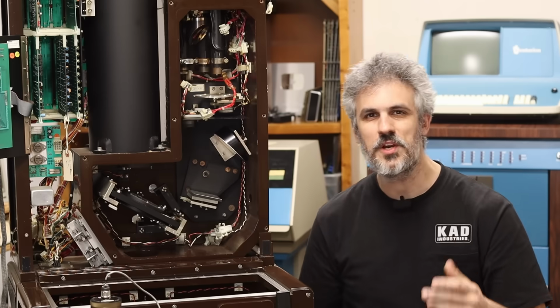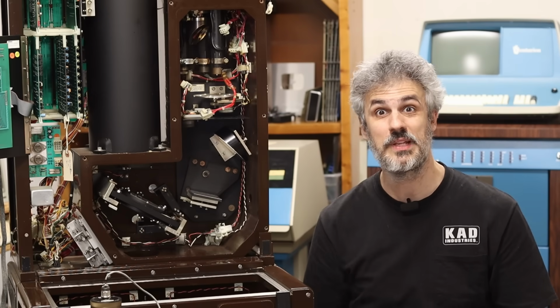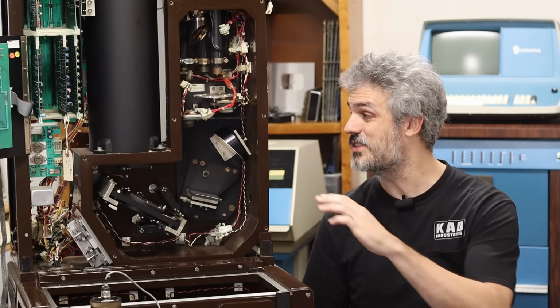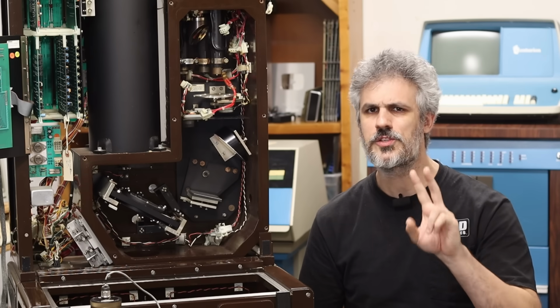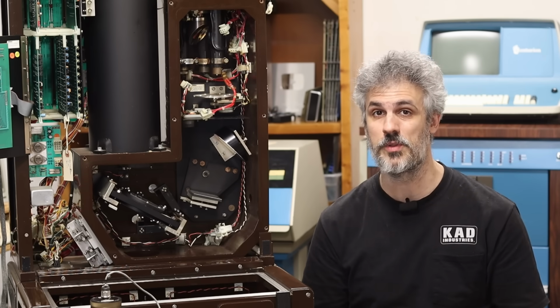So we have a beam splitter, we have a mirror and a tube that can move up and down, and we have a laser that will happily melt your eyeballs. Like, what on earth is going on here? This is far more complex than I ever could have imagined. But there are two big problems here that we gotta overcome, and these three things help us overcome those problems.